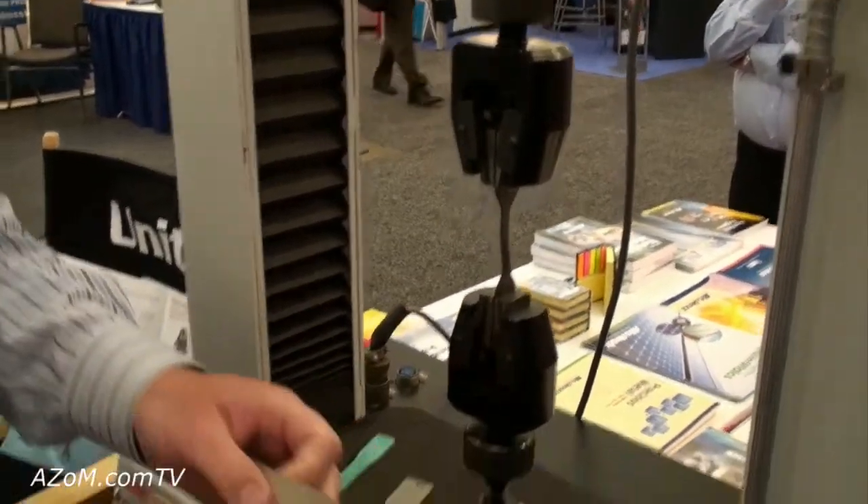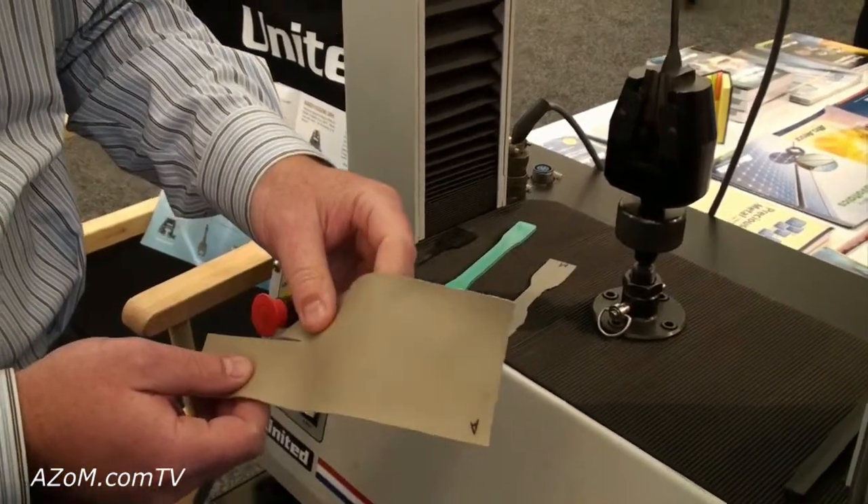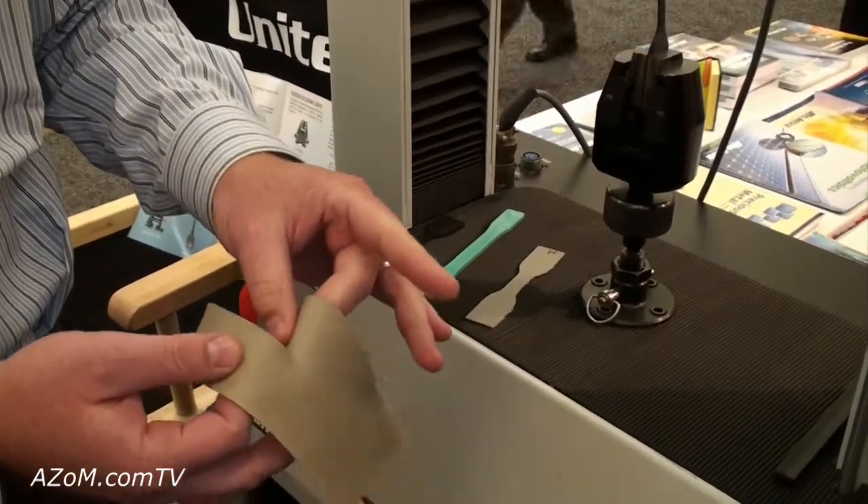Right here would be like a tensile tear test on an automotive material like a leather seat.